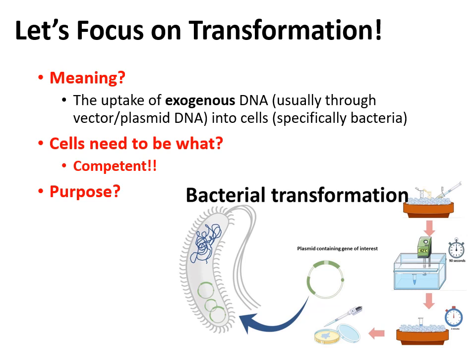But anyway, competent, what that means in terms of the bacterial cell, we're going to draw this out in a picture later in these slides. But for now, just know that competent means getting the bacteria ready to take in outside DNA, okay? Exogenous DNA. Basically, normally they wouldn't want to take in that DNA because of electrical charge issues that we're going to go into in more detail. But by making them competent, you get them ready to take in the new genes.